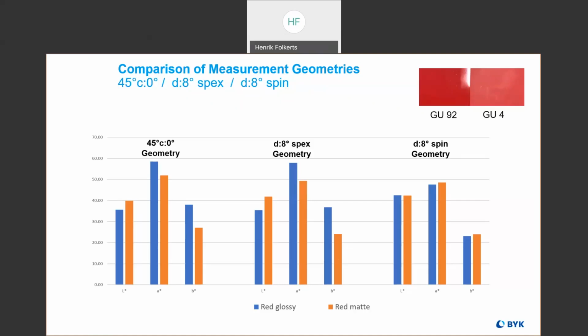We always want to make sure that we measure with that arrow that's on the side of the instrument going down, because you know the light source is coming from the top. And there's two green LEDs on the top that also tell you where the light source is coming from. So that's hugely important. I mean, Greg probably has some comments too.